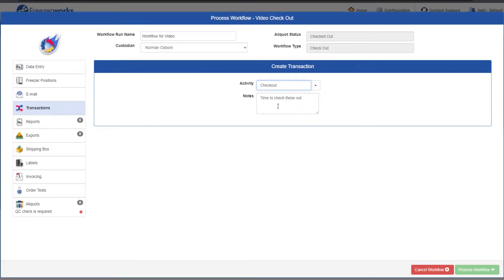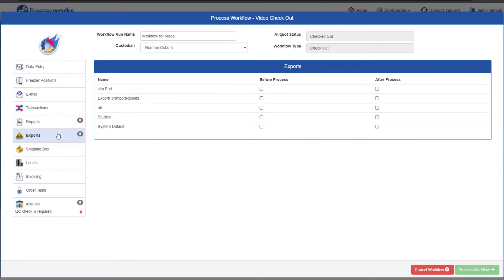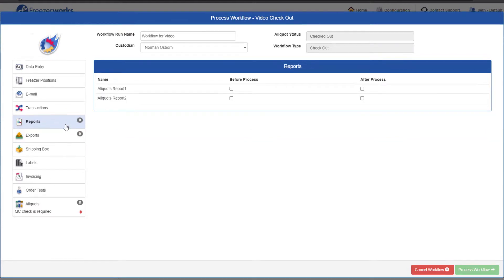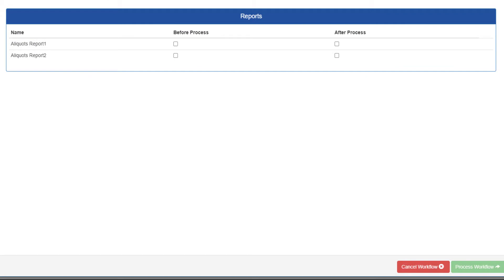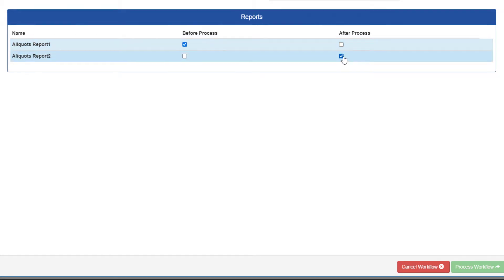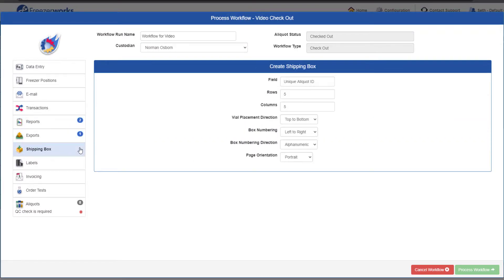The Reports and Exports pages are where you can pick and choose which reports and exports you want to download from your browser when the workflow is processed. Both pages function in the exact same way. Just pay attention to the Before Process and After Process columns. Checking a box in the Before Process column means the deliverable will be created for the aliquot data that existed prior to the workflow being run, whereas After Process will incorporate any changes from the workflow.